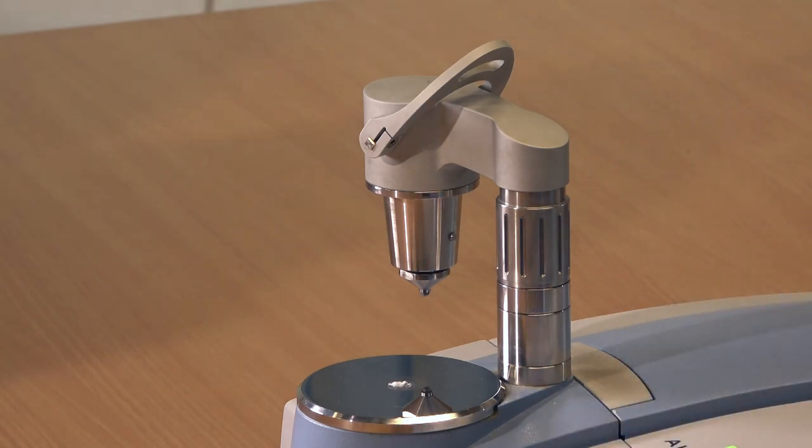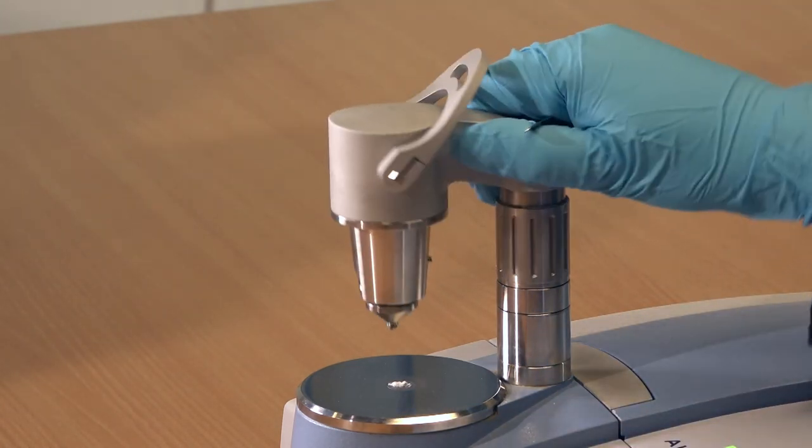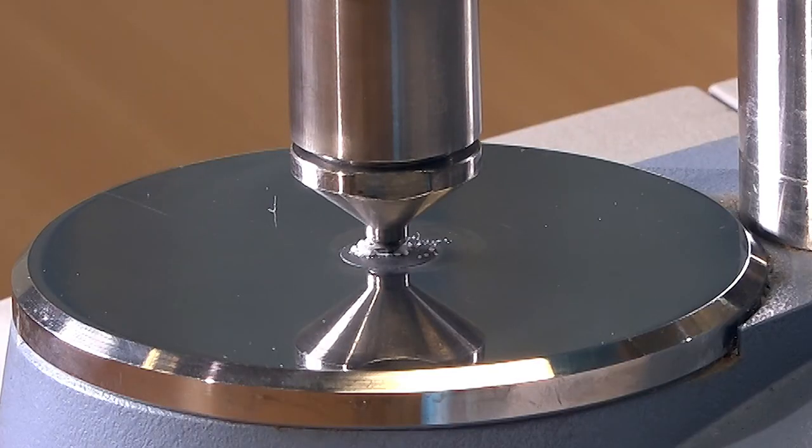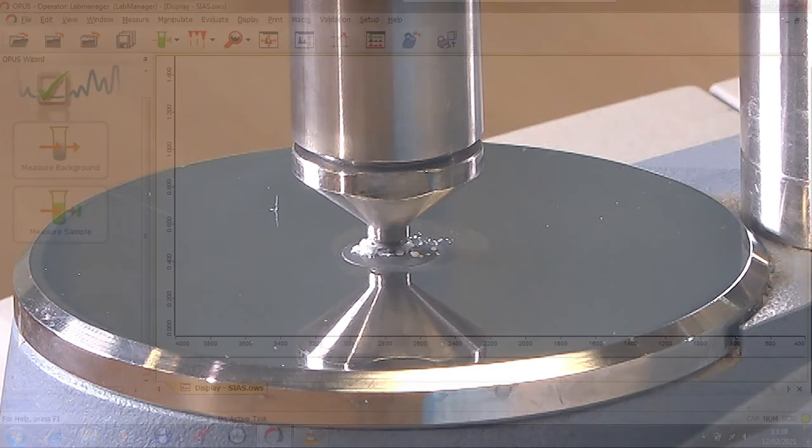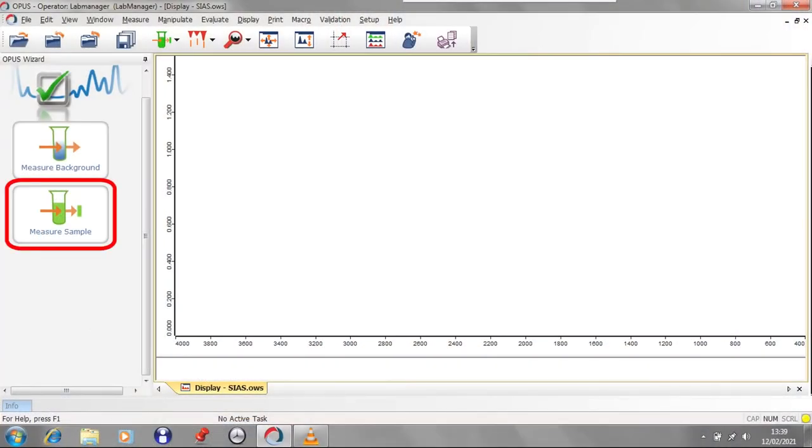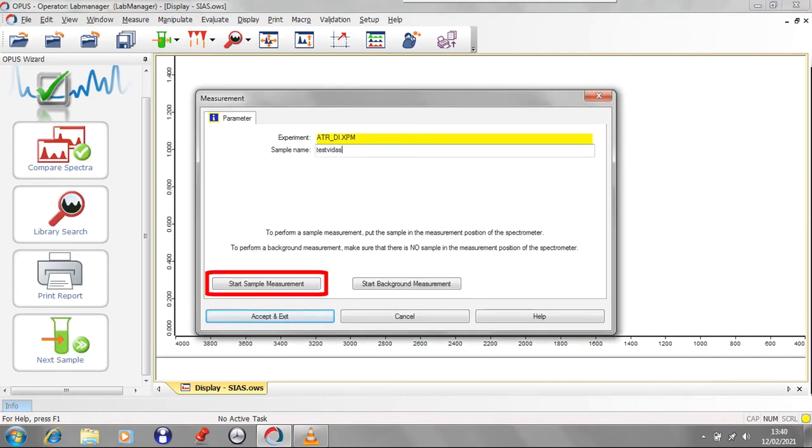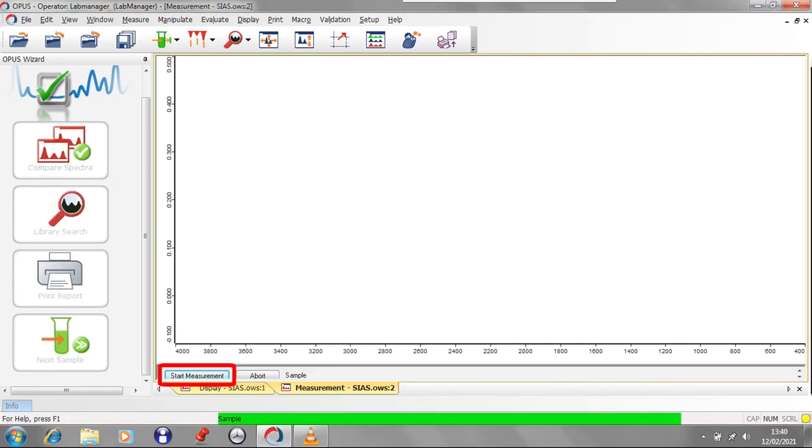Swivel the arm back over the window and push the handle forwards and down until it clicks into place. Failure to click will result in poor spectra due to poor contact between the solid sample and the diamond underneath. Click Measure Sample and, as before, change the sample name, then press Start Sample Measurement and Start Measurement. The spectrum will now be recorded.